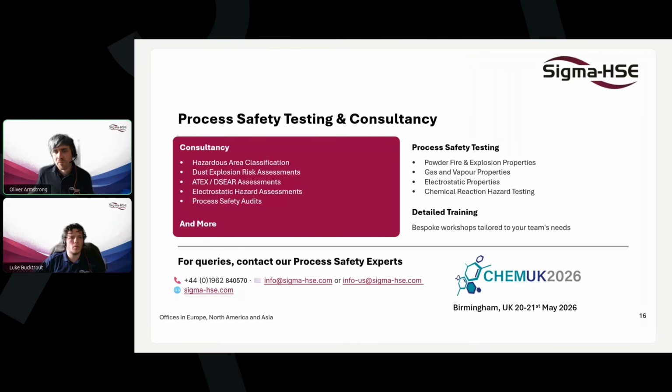So in terms of minimum requirements, where we've talked about difficulty with sampling heterogeneous mixtures, this is really up to an operator judgment of the equipment, to state that they have confidence that they've selected the right kind of material, and for that to be used in an assessment.